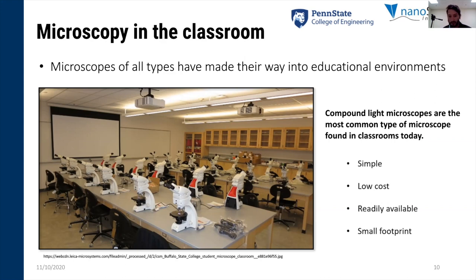Low cost as well. They're low cost because you need 20 of them. If you only need one of them and 20 different students can use it remotely, it doesn't necessarily need to be as low of a cost. Simplicity is obviously important regardless of whether you're using it hands-on or remotely. And as I'll show you today, the scanning electron microscope that we have here is very, very simple to use.